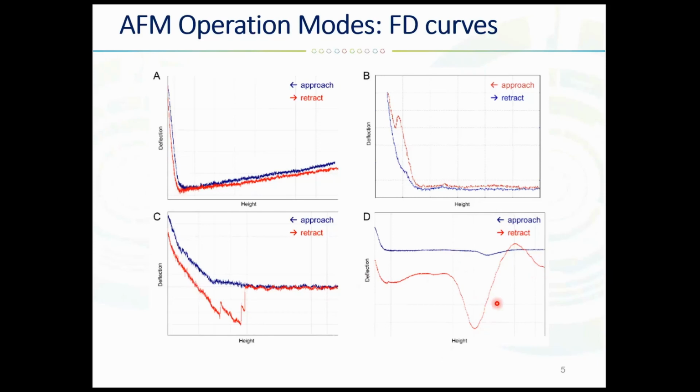In situations like this, you just make another measurement, and that's it, because this is clearly not the sample that you intend to measure, just some debris floating around.